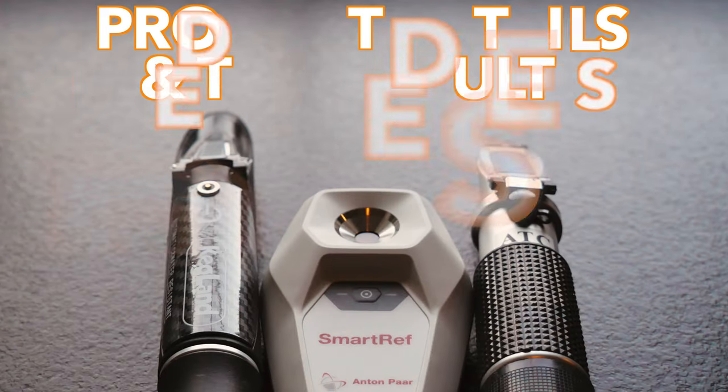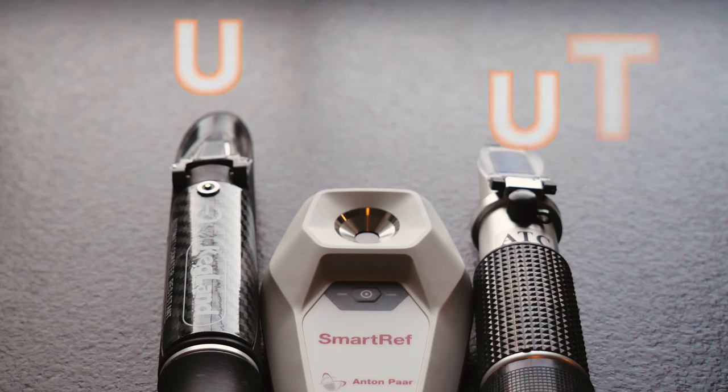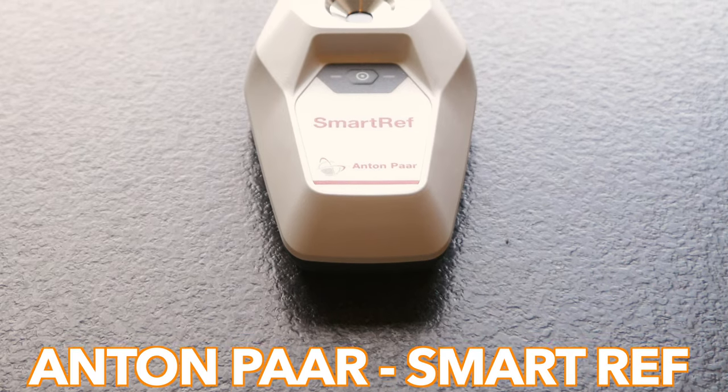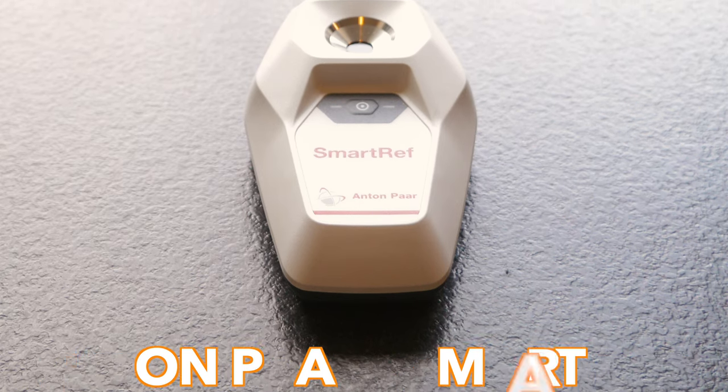Let's now take a brief look at each of these with some details first and then the test result, with the most expensive model first through to the cheapest at the end. The Smart Ref is by far the most expensive refractometer device here for this test and has a very impressive specification when it comes to accuracy.